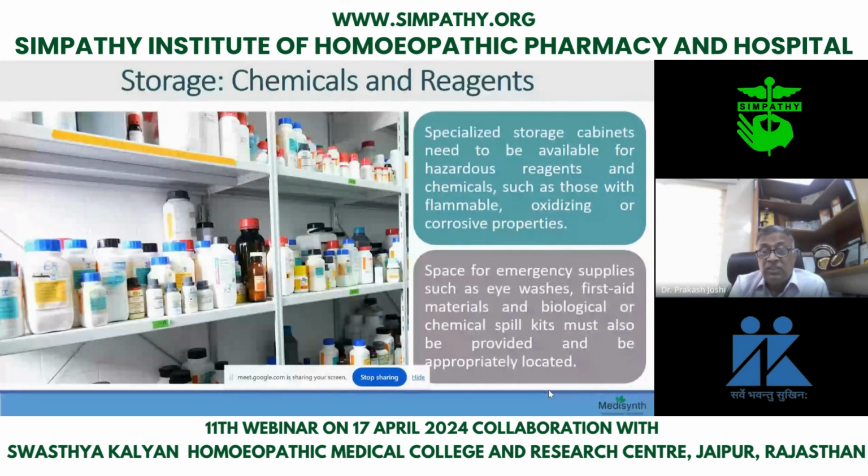Now, the special solutions, you can see here, available hazardous reagents, chemicals such as those with flammable, oxidizing, and corrosive properties. Nitric acid, you see, is very fuming, fumes are there. It is corrosive. So you have to keep it in such a way that it does not cause problems to the person using it. Because after all, we have laboratory attendants, assistants, and analysts also. Analysts understand each and everything, but the attendants do not understand the problem. So it is very important to teach them which chemical is hazardous and how to handle it. So these are all the basic training.